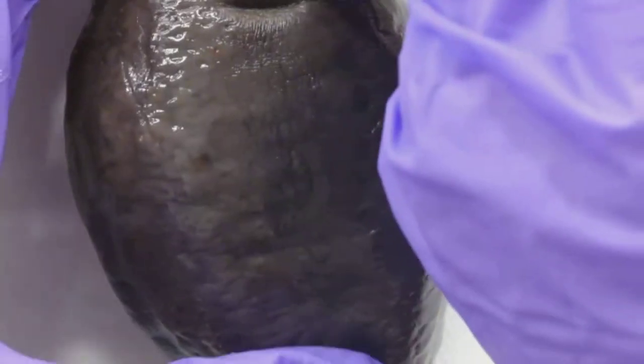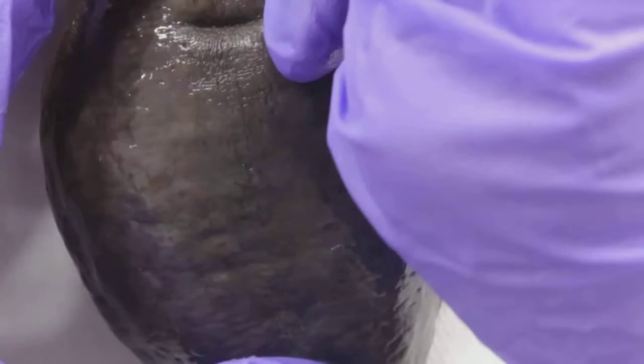I figured you might want to see this part because it's so... I'm using a scalpel. There we go. Oh, there's liquid in there. Of course there is.